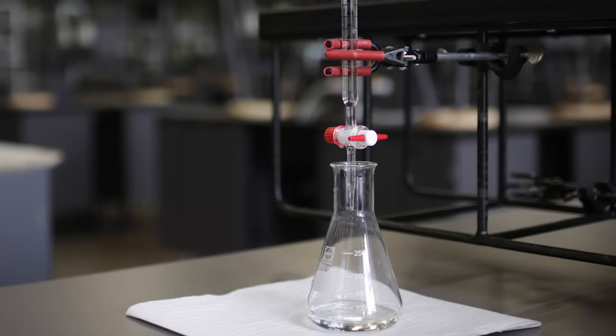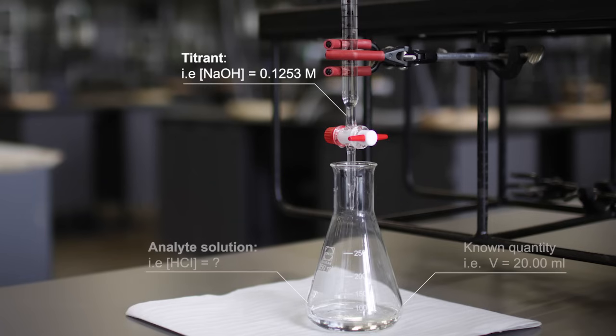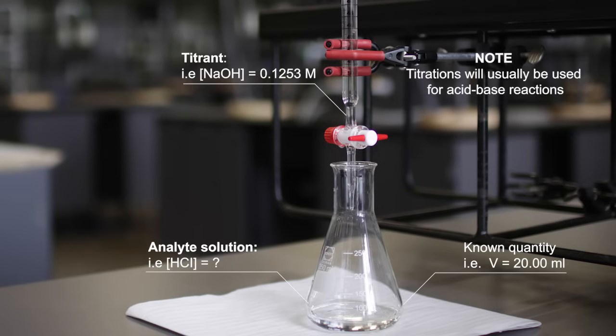Usually the solution of known concentration or titrant is added from a burette to a known quantity of the analyte, the unknown solution, until the reaction is complete which is indicated by the endpoint.